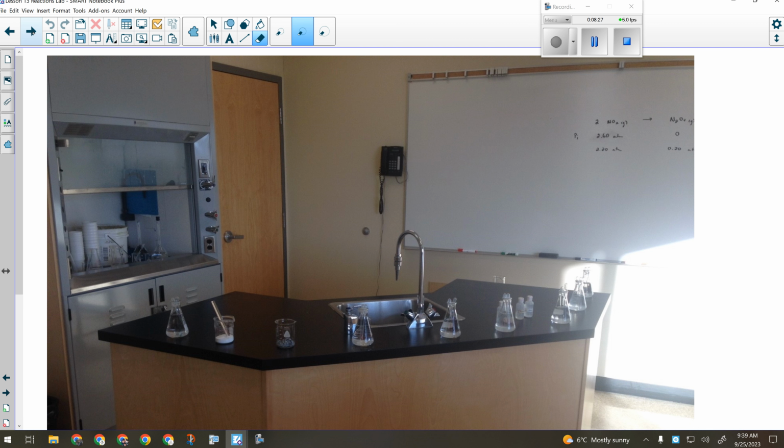The only one that's going to be an oddball is this stuff here, phenolphthalein. If you've watched CSI, it's what they use to detect blood. So if they swab something with the Q-tip or the swab, and then they drop that clear stuff and the swab turns pink, that's phenolphthalein that they use for that. Phenolphthalein changes color around the pH of human blood. So it goes from being clear to being pink when it changes its pH. So we use it as an indicator. It tells us approximately what the pH of something is.